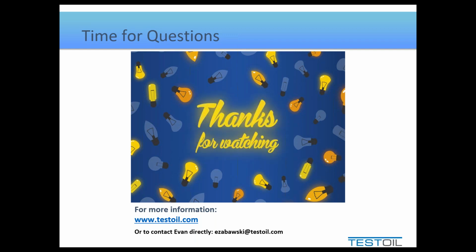So even if it's only run 2 hours a day, if you sample it every 3 months, you're going to get roughly 180, 200 hours between every sample. And as long as you continue sampling every 3 months, you're going to have that roughly 200 hours of oil and machine hours build up over time. You don't need to report it. It's just good that something is provided.